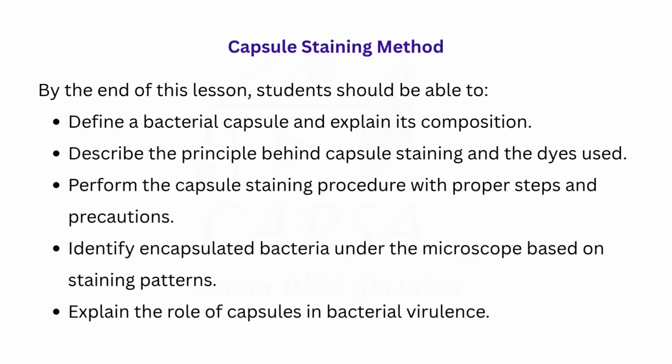Hi everyone, welcome to today's lecture where we will understand one of the essential techniques in microbiology, capsule staining. Now you might already know that bacteria can have various external structures, but one of the most important when it comes to infection and disease is the capsule. This outermost layer plays a crucial role in helping bacteria survive and evade our immune system.